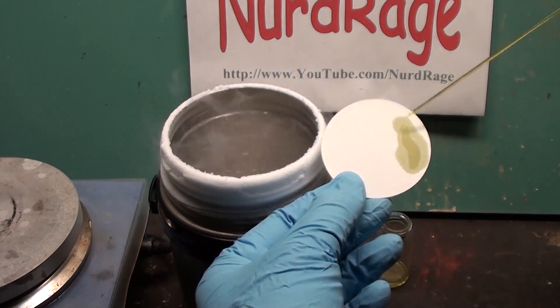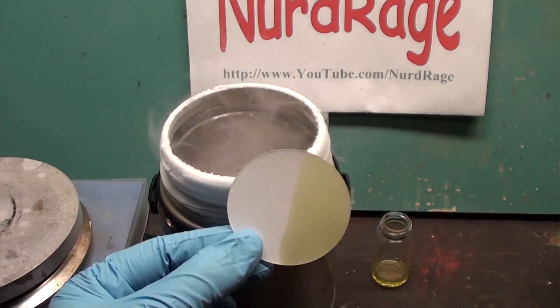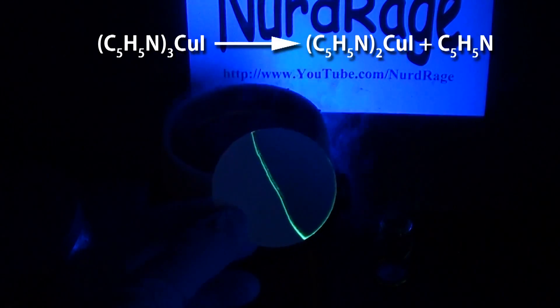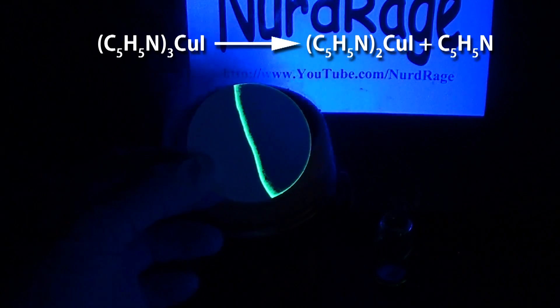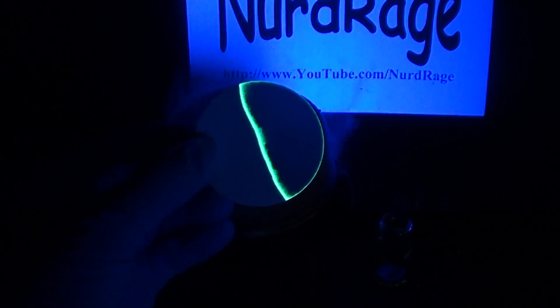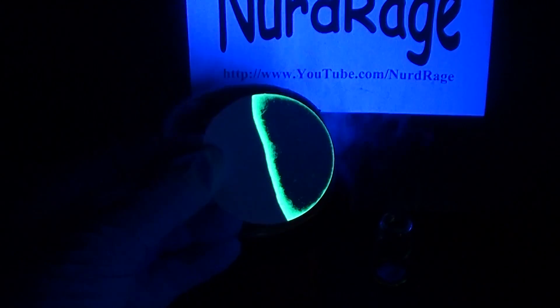For the second experiment, we get a sample of the solution and put it on some filter paper and let it dry. As it dries, it loses a pyridine molecule to become bis-pyridine copper iodide. It'll take a few minutes, but it'll be obvious under ultraviolet light as the bis-pyridine copper iodide has a bright green fluorescence at room temperature.